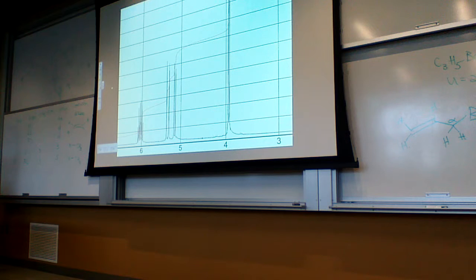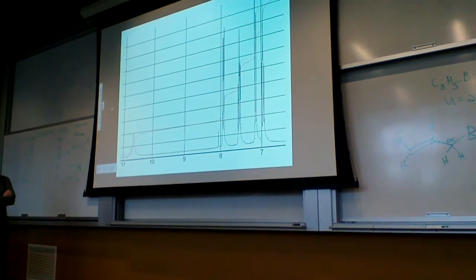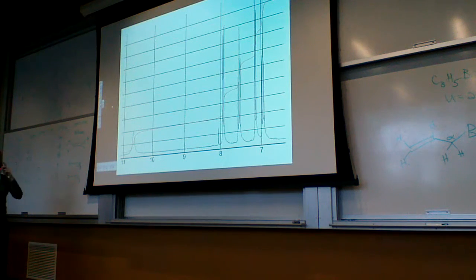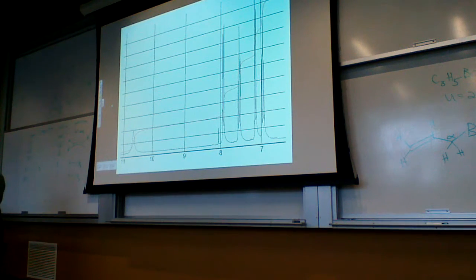The last example I wanted to talk about has the aromatic region in particular. The aromatic region, again, if you have an aromatic ring, you know that you have the standard benzene core, so you have the 6 carbons, and in a standard benzene you'd have 6 hydrogens.